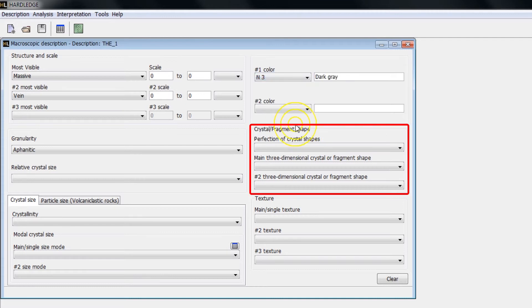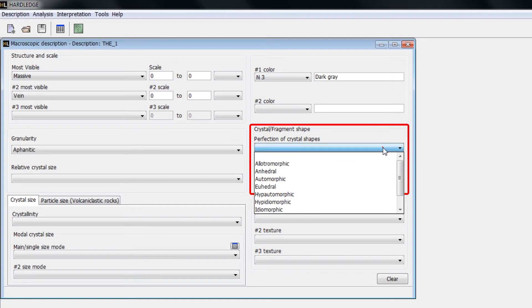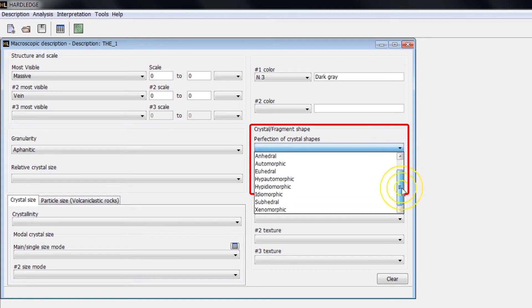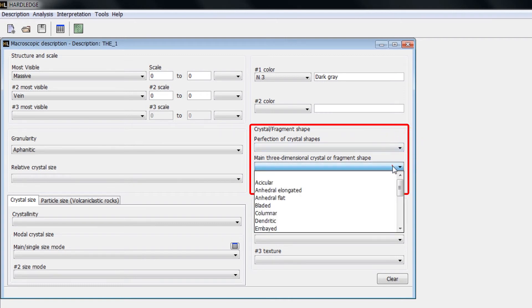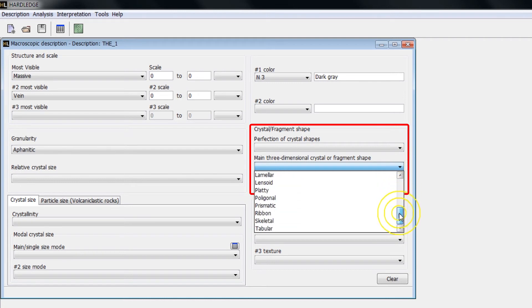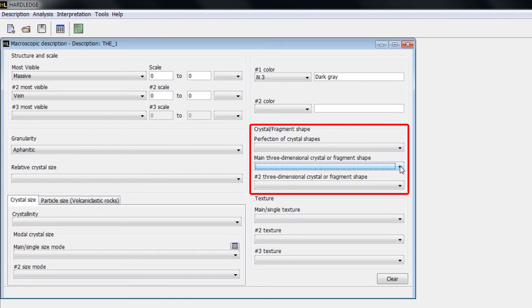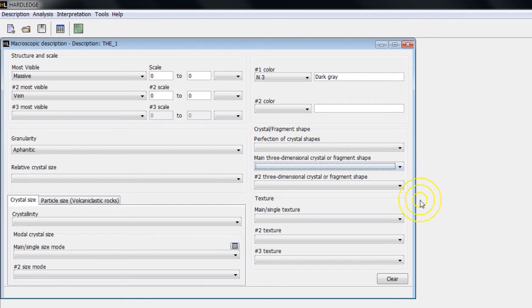In Perfection of Crystal Shapes, inform the macroscopic evaluation of the predominant degree. In Main Tridimensional Crystal or Fragment Shape, inform the predominant form of crystals or fragments that constitute the rock. You can also inform the second most important shape occurring.